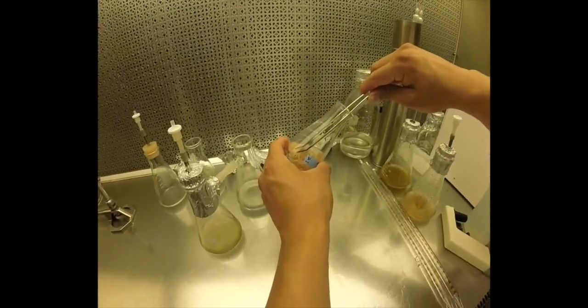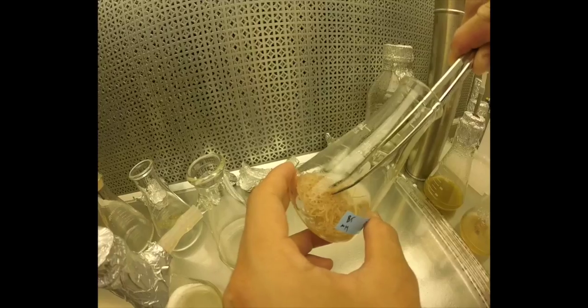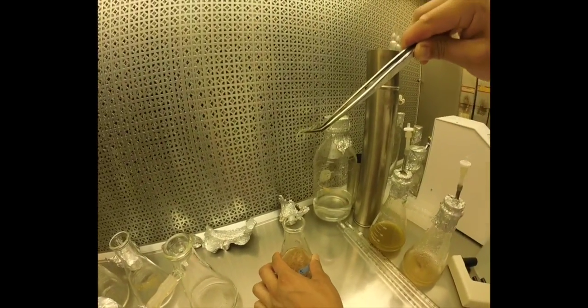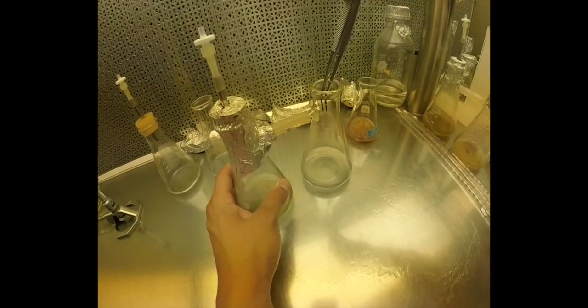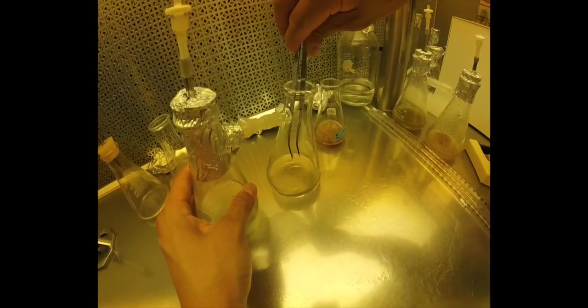The tip of some of these roots on the edge, and you can try to let them fall. Sometimes it does not do that, so you need to actually dip them in.